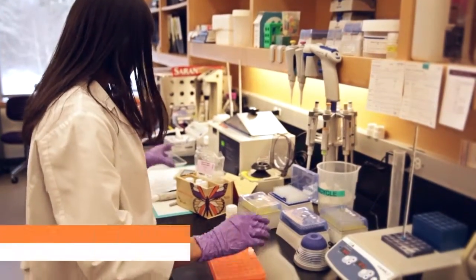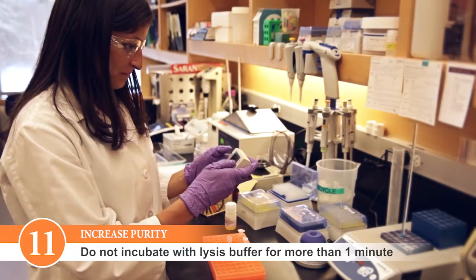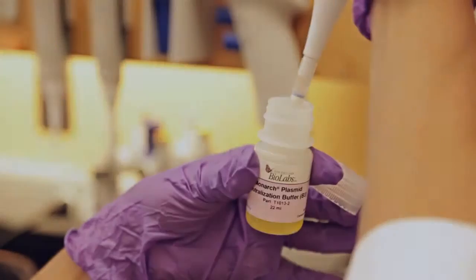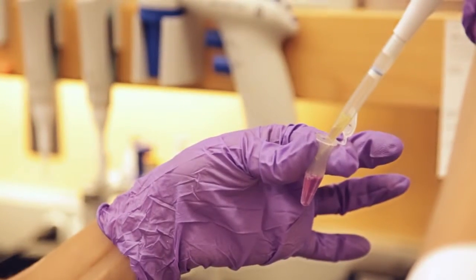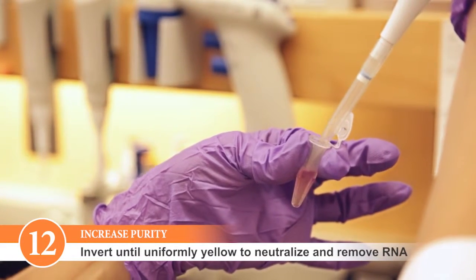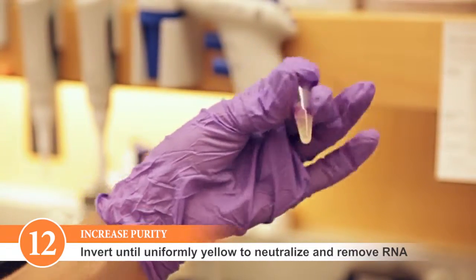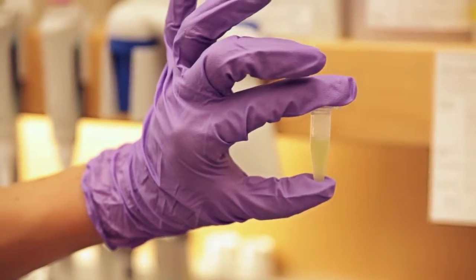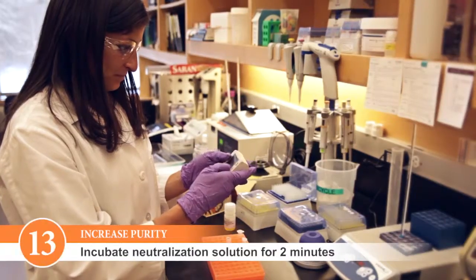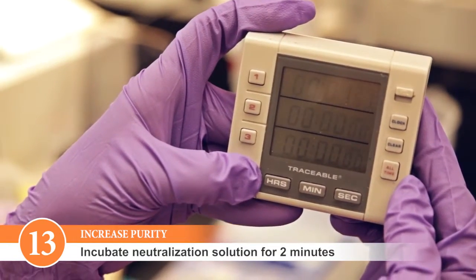To avoid DNA denaturation during the cell lysis step, do not incubate samples longer than one minute. It is important to avoid RNA contamination. When neutralizing the solution, invert the tube sufficiently so that the solution is uniformly yellow. This allows for complete RNA treatment of the sample. Make sure that you incubate the sample for a minimum of 2 minutes, which will guarantee complete degradation of the RNA in your sample.